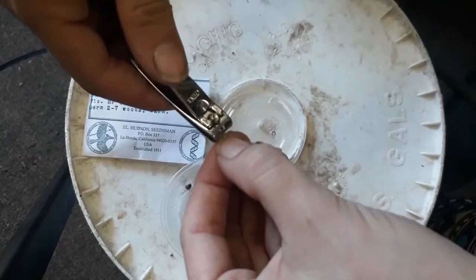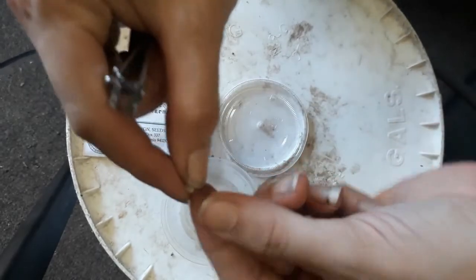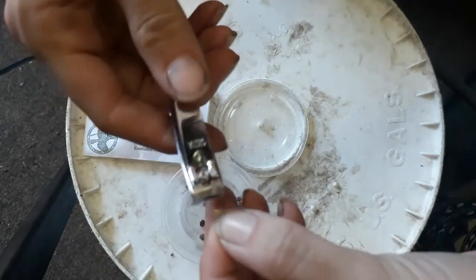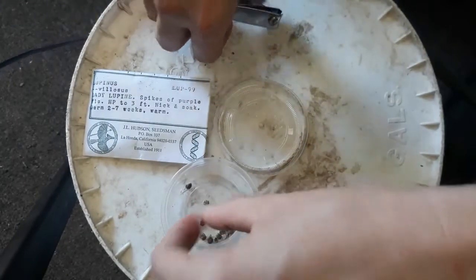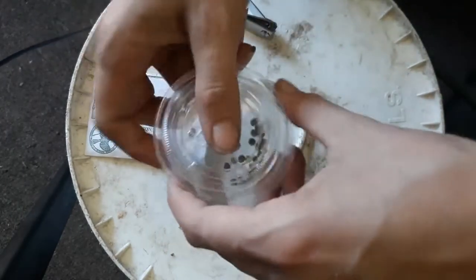We're going to label our treatments so that we know which one is which. I'm going to label this one 'nick and soak' and then I will add some room temperature water to it. It also likes to be warm when it germinates, so I'm going to put these in the greenhouse.